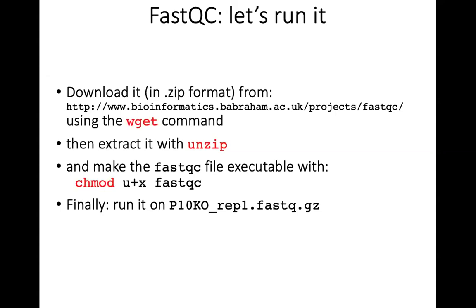Okay, so once you have run FastQC, for your FastQ file, it should have produced an HTML file. So download that HTML file to your computer, and then open it. You can double click it. It's going to open in Safari, and you're going to have these plots that we've shown.